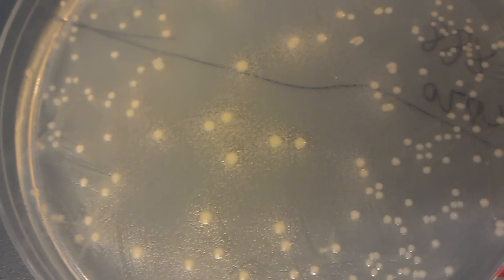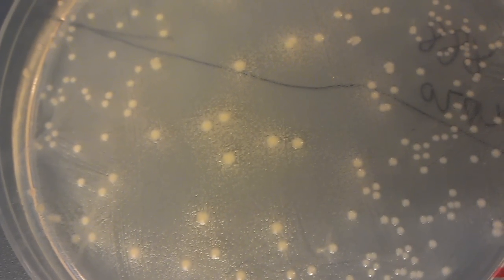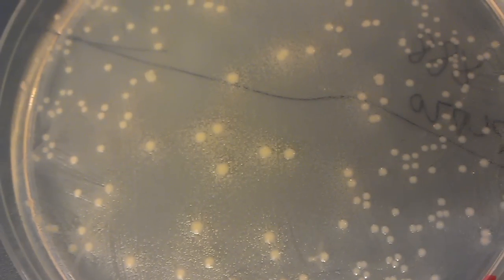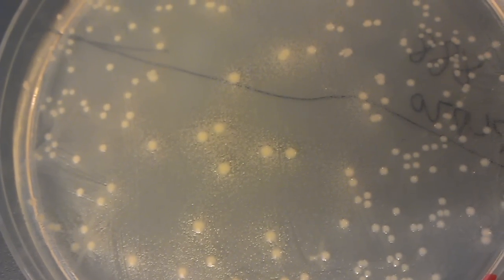So hopefully you don't have the satellite colony problem, but if you do, try to pour cooler plates and don't leave them out in the light, and that should solve a lot of the problems.